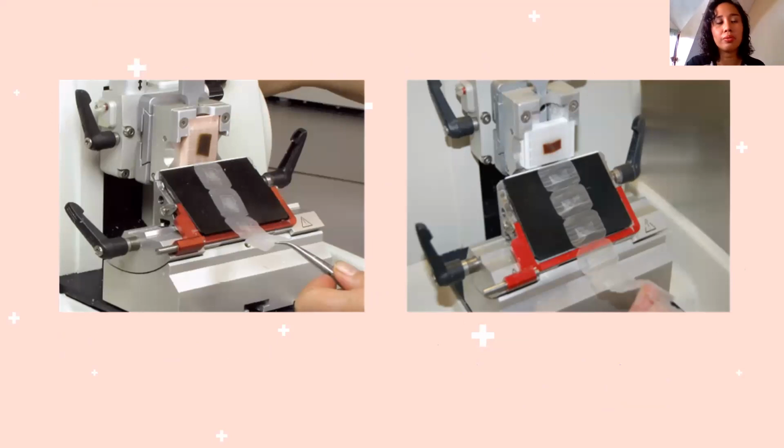I'll show you a video. Ito yung magkakaroon ng tissue ribbon. So, itong tissue ribbon na yan, tingnan nyo naman, gusot-gusot. Parang may mga streaks. So, nilalagay yan sa flotation bath para mawala yung kusot-kusot. Para flat siya, hindi kusot-kusot, walang fold-fold. So, flotation bath mo siya. Anyway, darating rin tayo dyan.